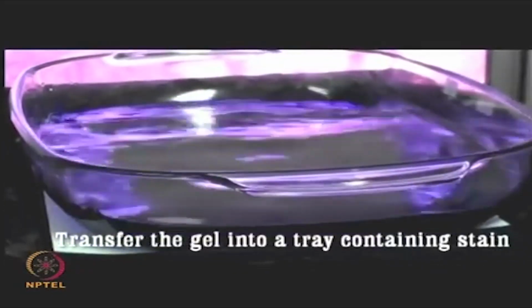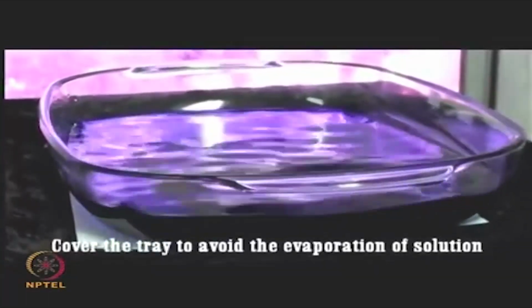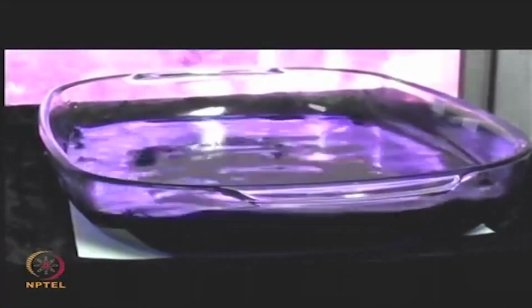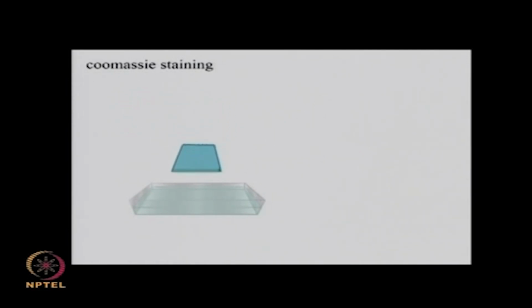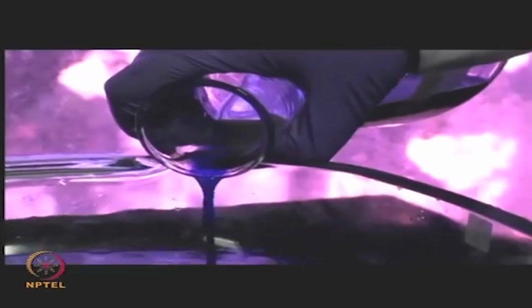Transfer the gel carefully into another tray containing the Coomassie blue staining solution and place it on the shaker to ensure uniform contact of the gel with the solution. The negatively charged Coomassie dye interacts with protein through ionic and other non-covalent interactions, thereby staining them with a blue color. Add some more staining solution such that the gel is completely immersed and leave it overnight for around 8 to 10 hours.